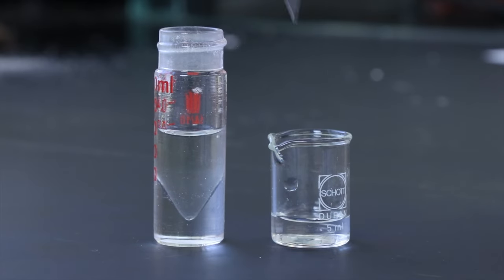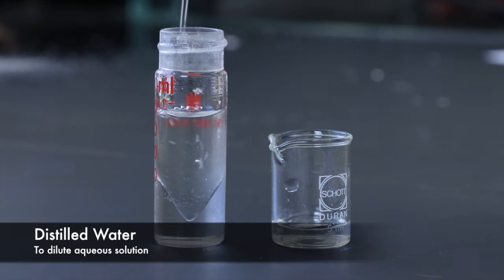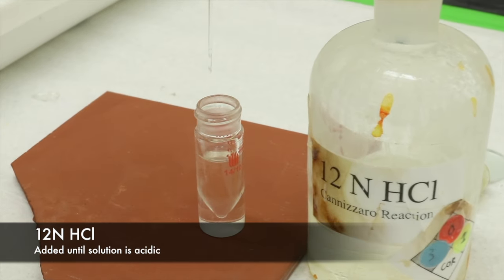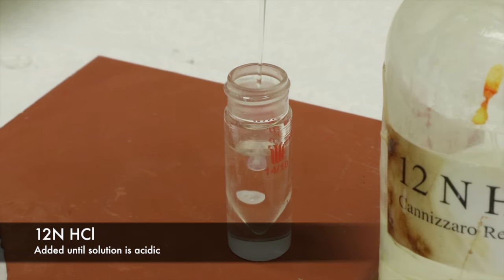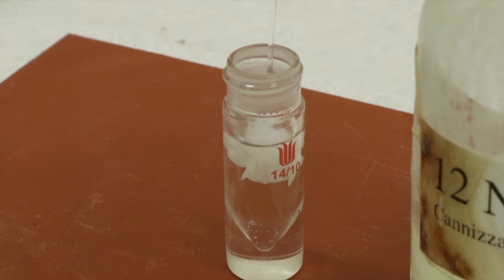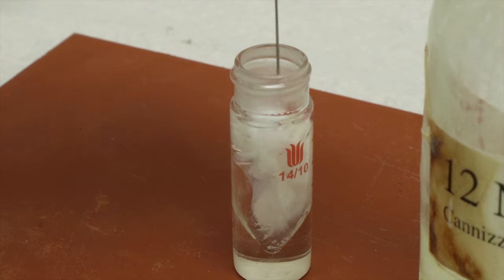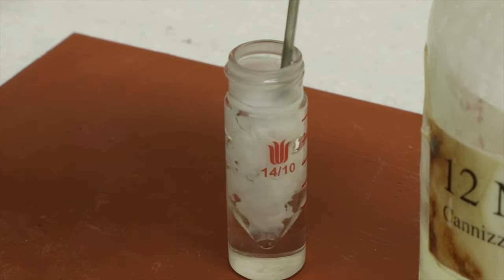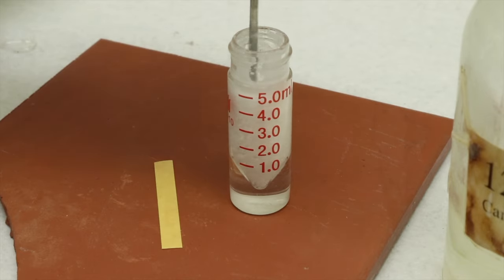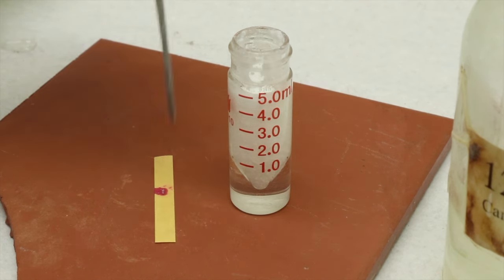Okay, I've got the conical vial with the acid product, and I'm going to dilute the solution a little bit more with some additional distilled water. Now I can add the concentrated hydrochloric acid, and you can see the product precipitating out of solution in that white slurry as it's neutralized by the added acid. And I'll make sure that I add enough so that the solution itself is acidic, meaning that all of the acid product will be protonated and no longer dissolved. To make sure I added enough acid, I'll test the pH of the solution, which should turn the pH paper pink, so it looks like we're good here.